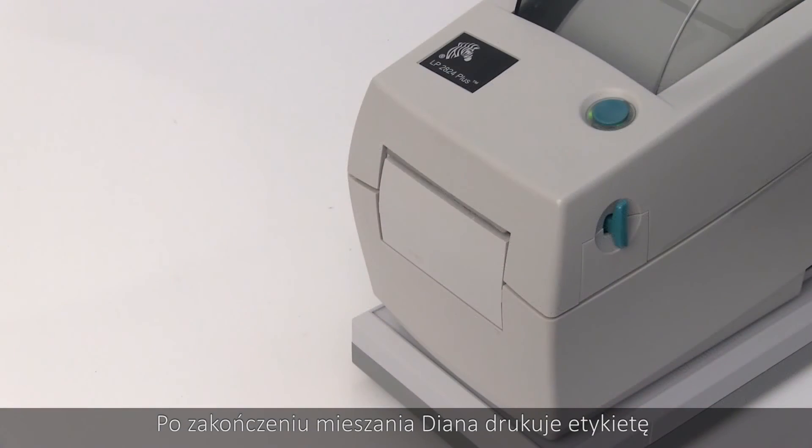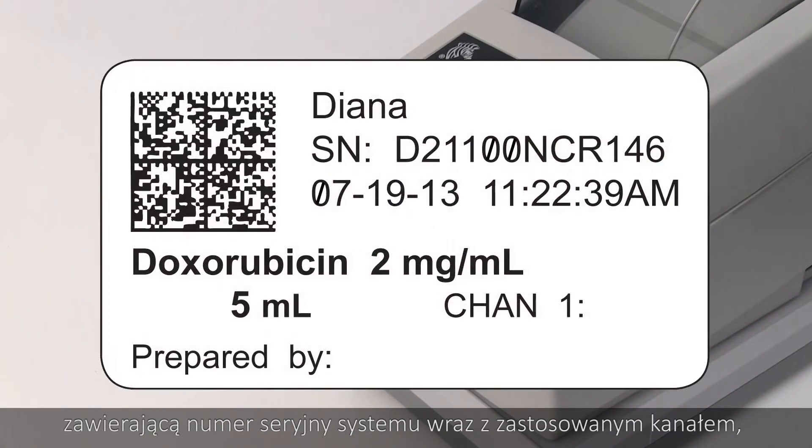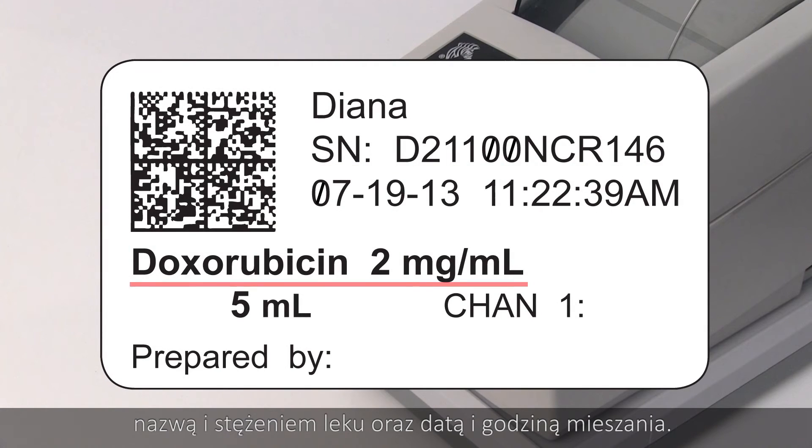After the mix is complete, Diana prints out a label containing the system's serial number, along with the channel used, the drug name and concentration, and the volume, date, and time mixed.